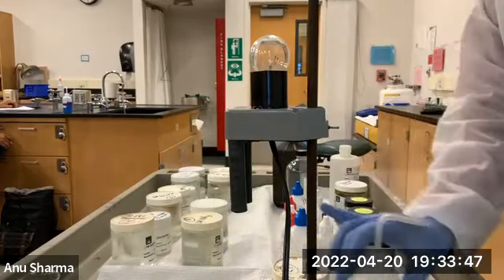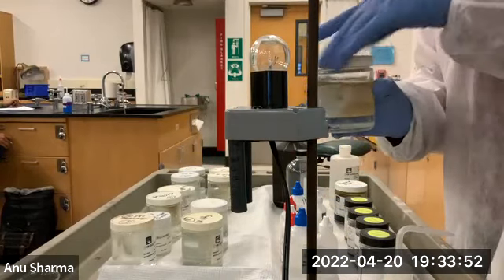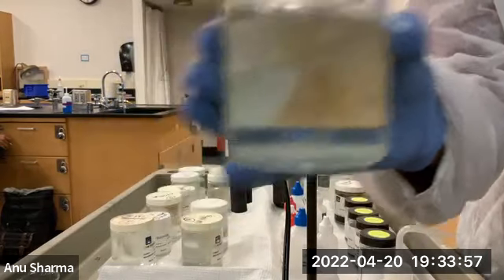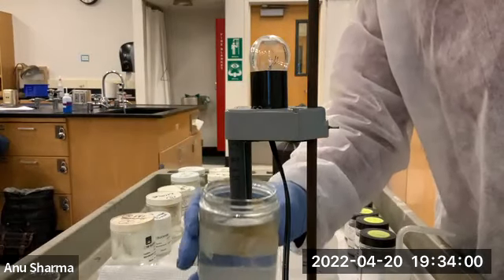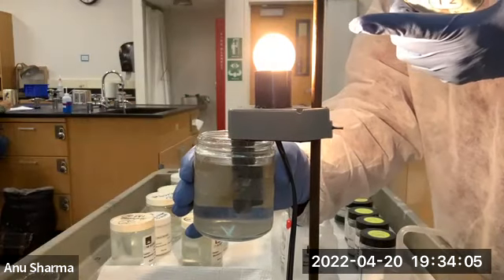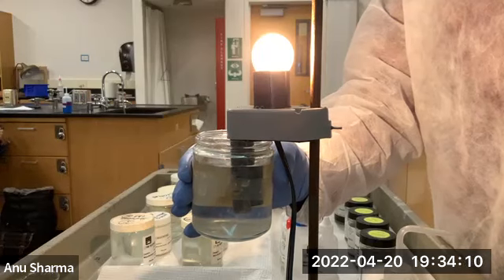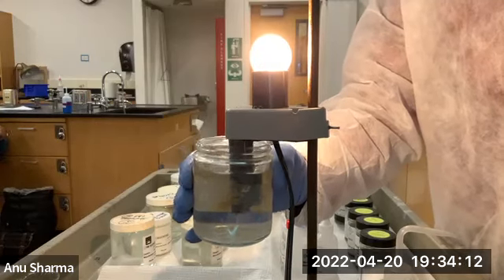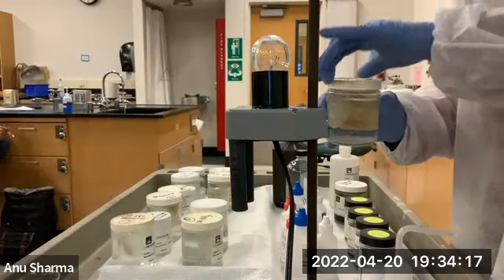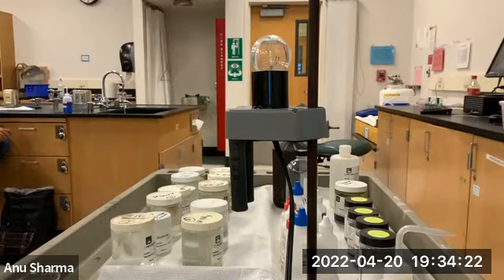All right, now we have sulfuric acid, H2SO4, okay? Very strong acid, very nice and clear solution. Because I'm very close to the filament here, I can see the glow, the extent of the glow. So extremely strong acid. And the stronger the acid, the stronger the electrolyte it is. So sulfuric acid is a strong electrolyte. Both of them are strong electrolytes.